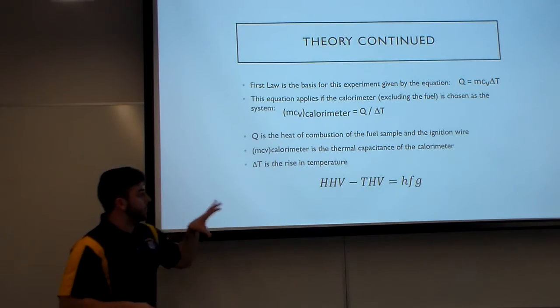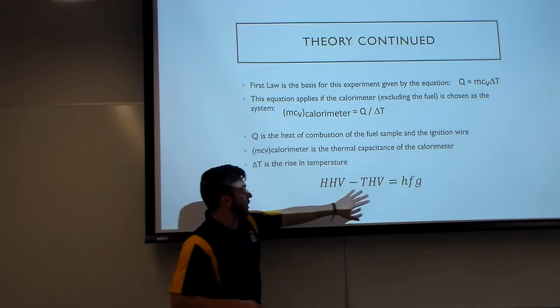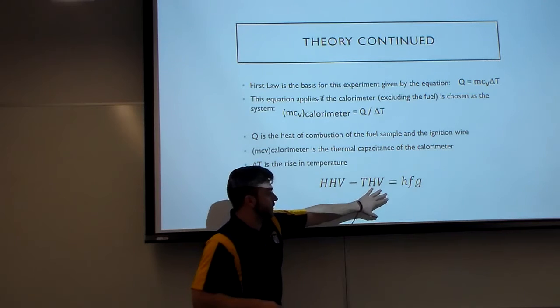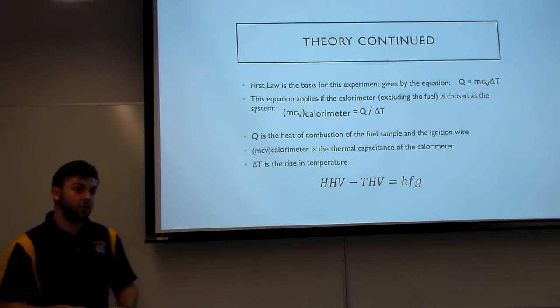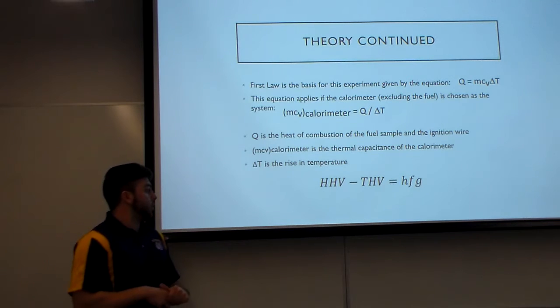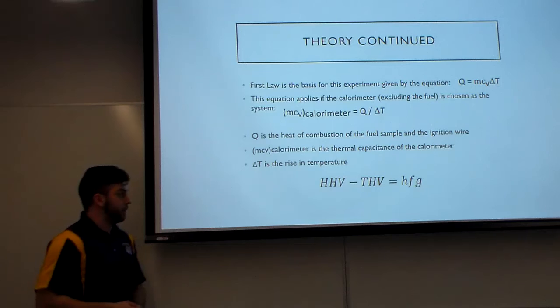An important thing to note, however, is we do have the higher heating value and the lower heating value, which is our heat of vaporization. During every combustion, there will be some water vaporized, and we need to be aware of that whenever we're taking data.